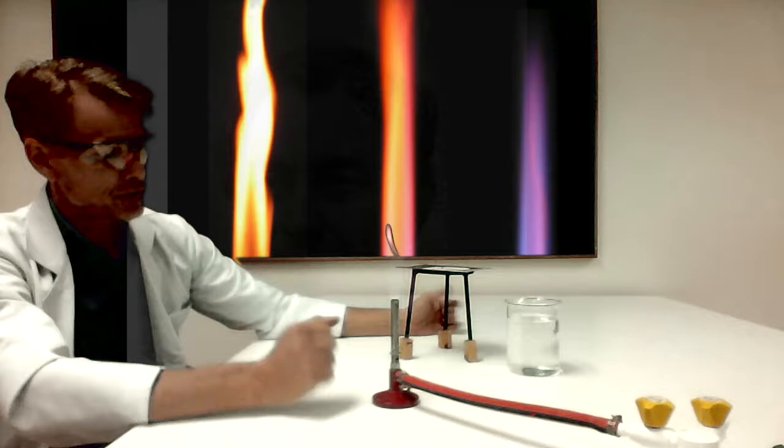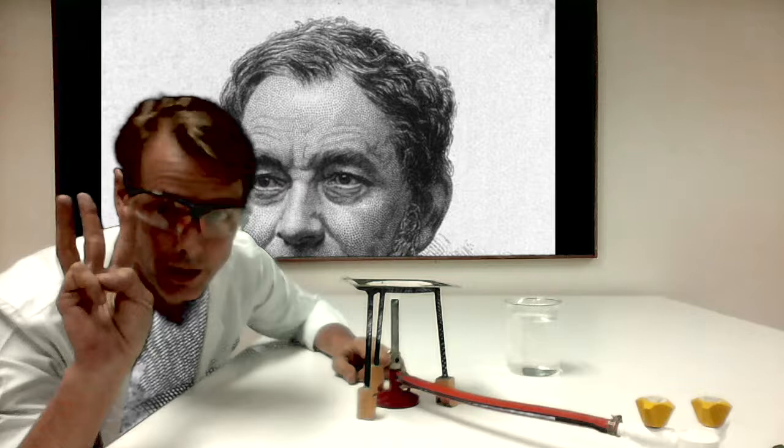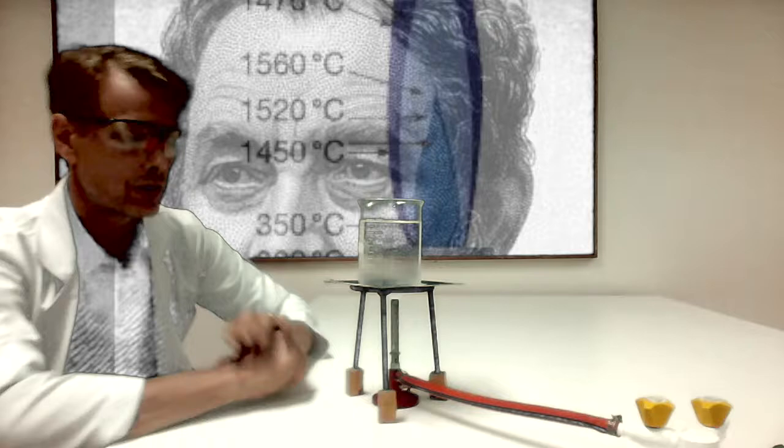Bunsen burner, why is it called that? Tripod stand, why is it called that? Maybe because it has three legs. A beaker, why is it called a beaker? I don't know. Maybe you do. This one holds 500 milliliters of water. That's 1/2 a liter. How long do you think it would take to heat this?